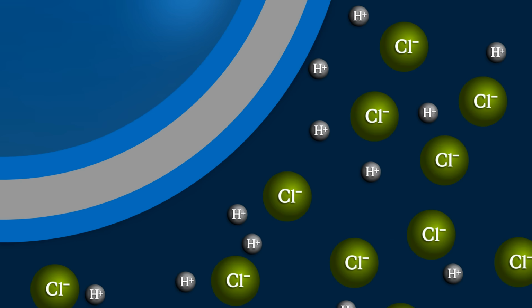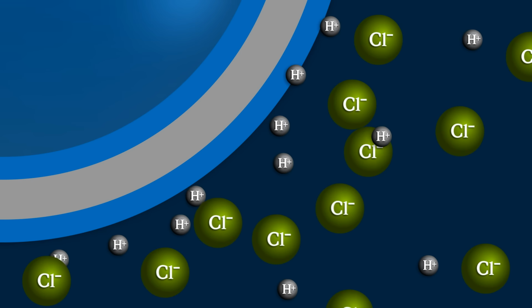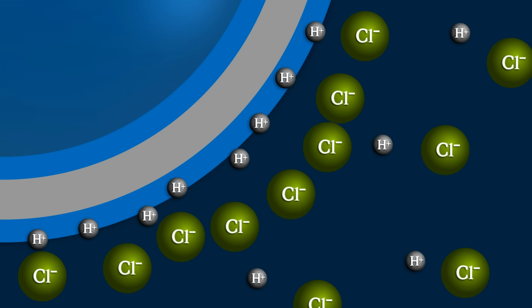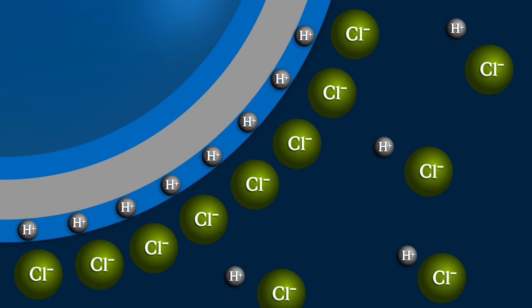Diluted hydrochloric acid, for example, contains large negatively charged chloride ions and small positively charged hydrogen ions. When the pH sensor is immersed into this acid, the hydrogen ions are able to penetrate the boundary area of the glass membrane, the so-called gel layer. The considerably larger chloride ions remain in the solution. The result is a charge separation. The same process occurs on the inside of the sensor with the neutral solution buffered at pH 7 that has a constant concentration of hydrogen ions.